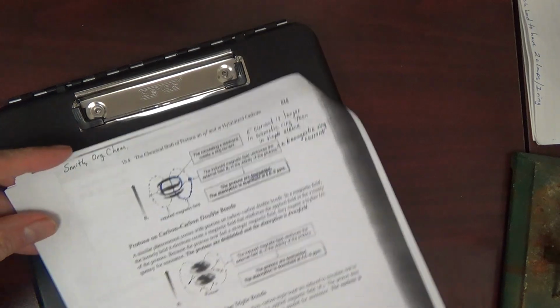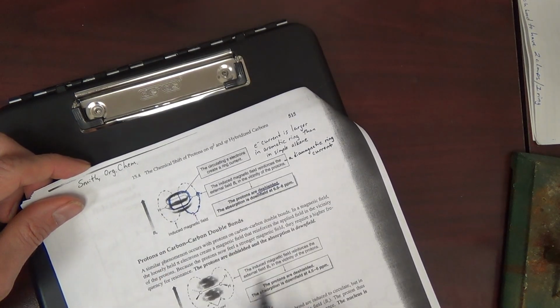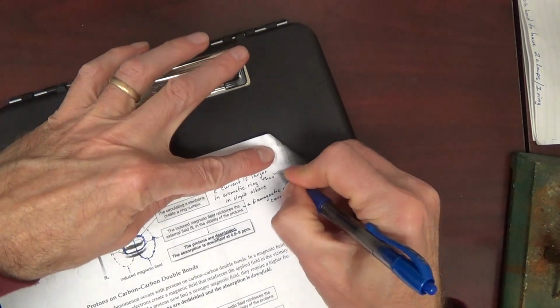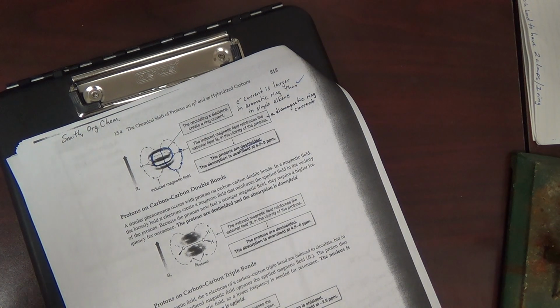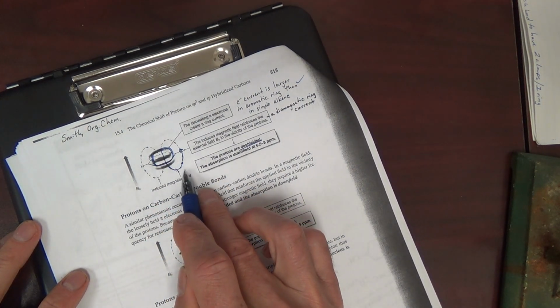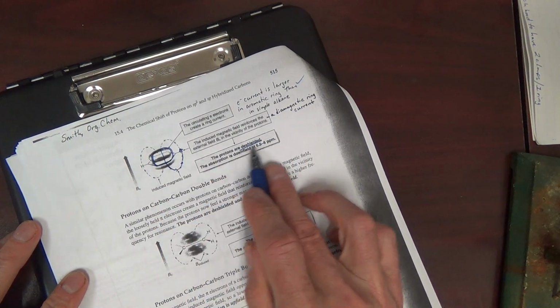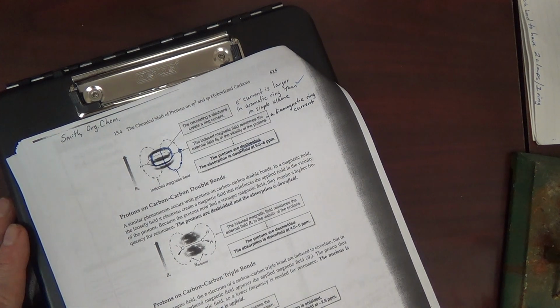The reason being that the magnetic field from your aromatic is stronger than from an alkene, and I think I mentioned that up here. So the electrons in the aromatic are going to lead to even more de-shielding than what the alkene would do.